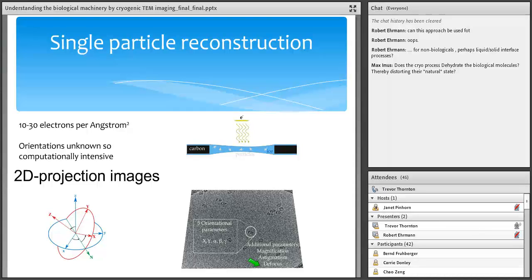That is so odd, isn't it? Because all the microscopes I've ever used, you want to have the best possible focus, and now here you're defocused. So you want to work at what's called Scherzer focus, which will be where there's no Fourier inversion due to the contrast transfer function. And so that's basically inducing contrast by making your image bad. Now what we do is we mathematically solve for that convolution.